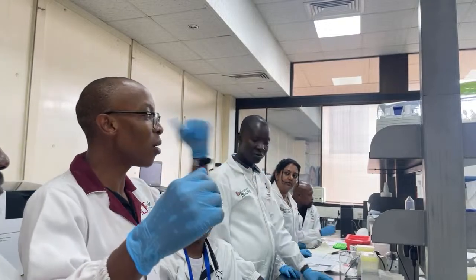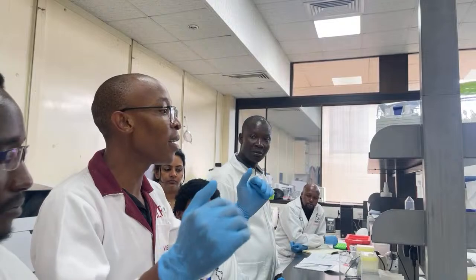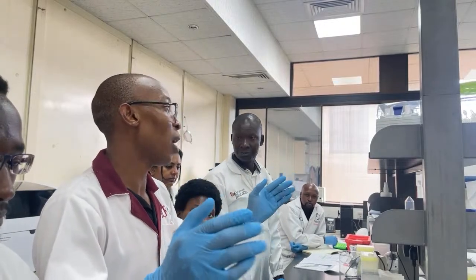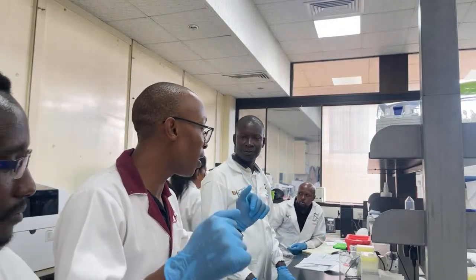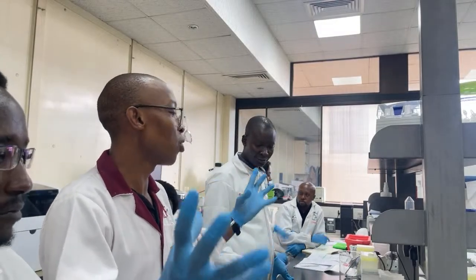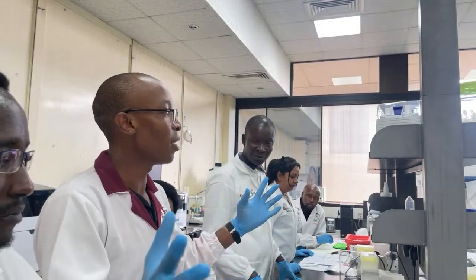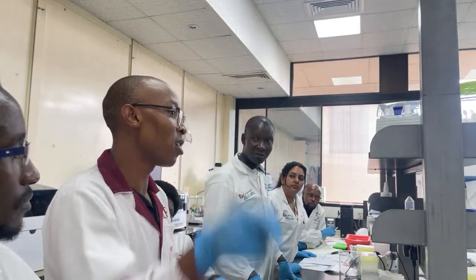That's why I said in my presentation that at the end of shearing and everything, you do end repair and A-tailing. So why do we have A-tailing? Our adapters have the T overhang. So you ligate them, and then you have a structure. And when the polymerase goes around, that structure becomes a circle. So it just rolls.